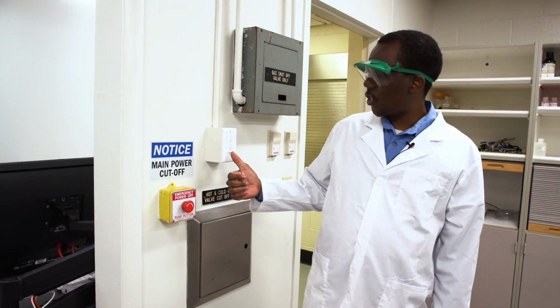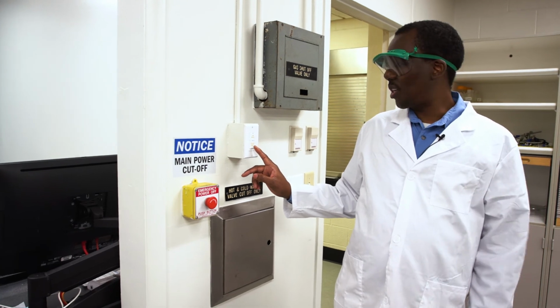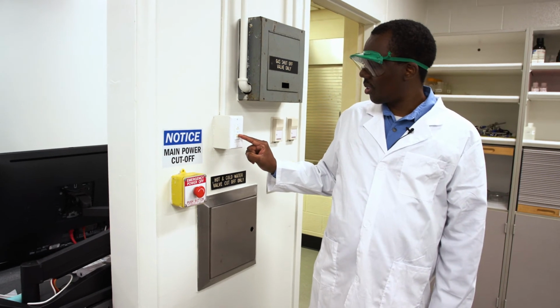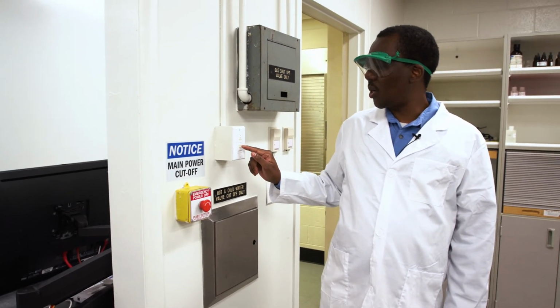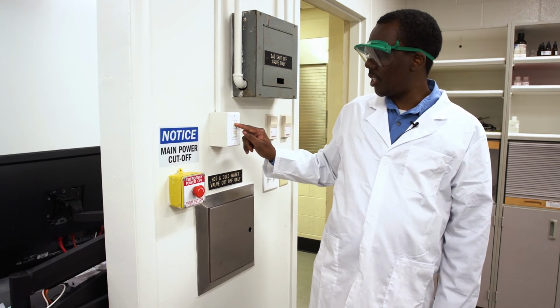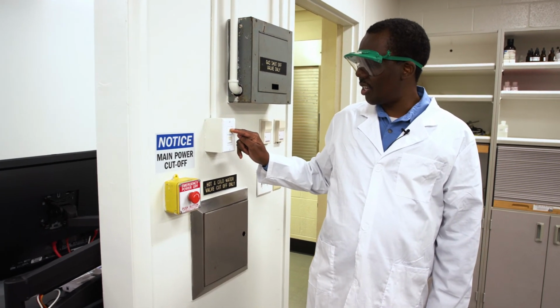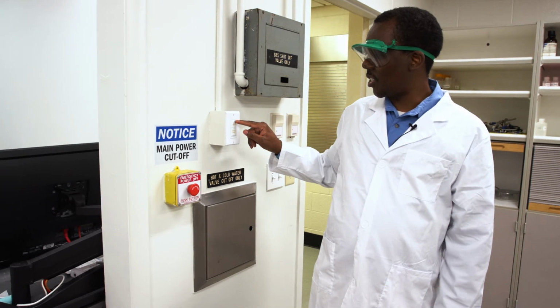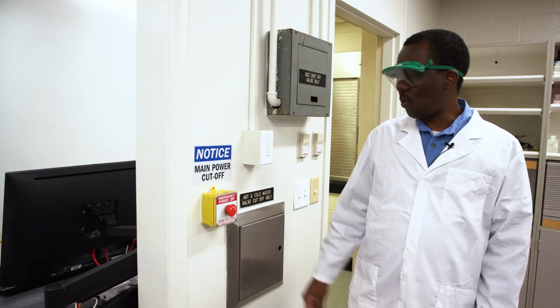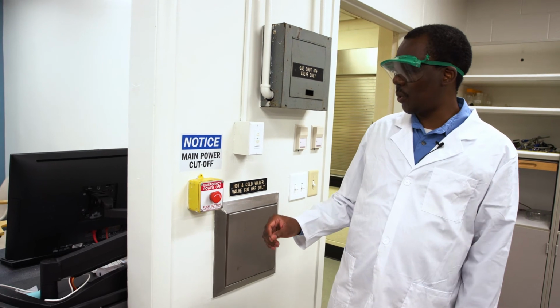Now we have two things shown here. One is the switch that will turn on the fume extraction vents. Your instructor may already have pressed the lab mode. Right now, this says lecture mode. If you press and hold the top button, it will increase the rate of extraction on those vents. It will go blue here, and the rate of suction will increase. That's one thing to check if you needed to be sure.